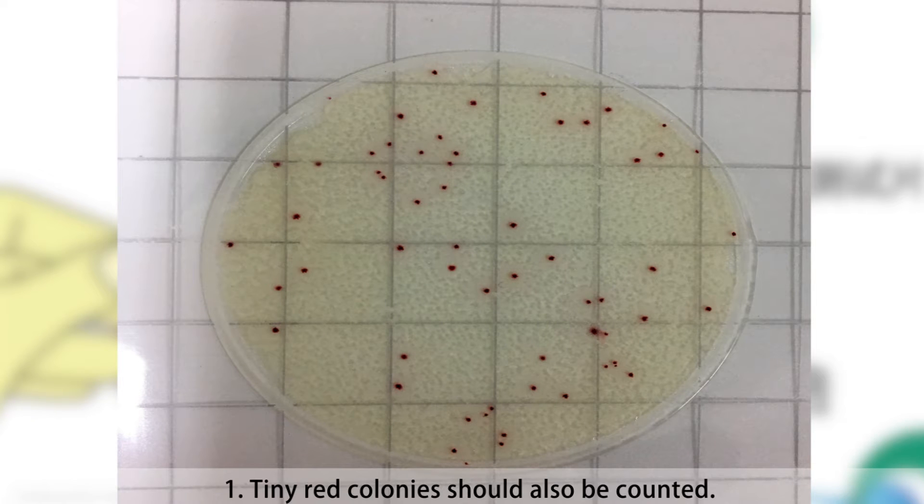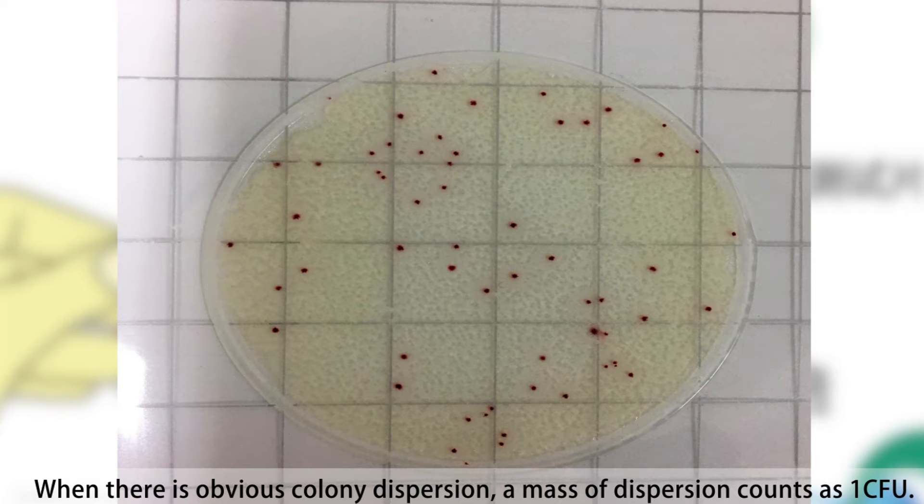Notice: First, tiny red colonies should also be counted. When there is obvious colony dispersion, a mass of dispersion counts as 1 CFU.